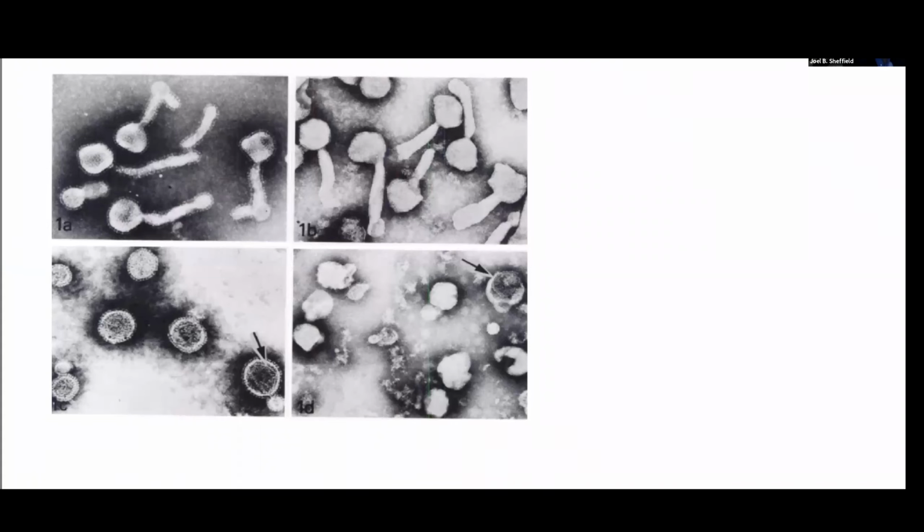When I started doing work on, as it turns out, the mouse mammary tumor virus, we looked at isolated virus by negative stain techniques primarily. And what we found as a characteristic structure for the isolated virus was something that looks like what you see in figure 1a. That is to say, it was something with a head and a tail, and a series of spikes all the way around this virus.